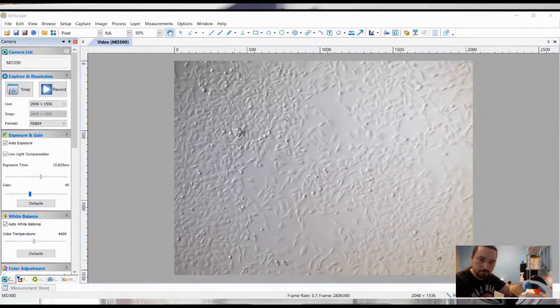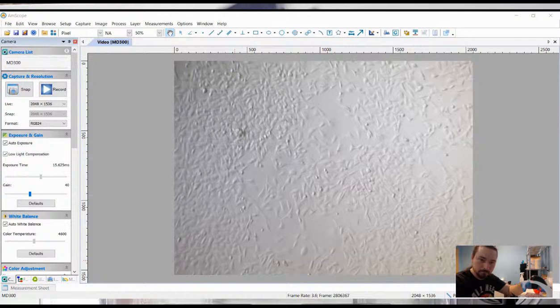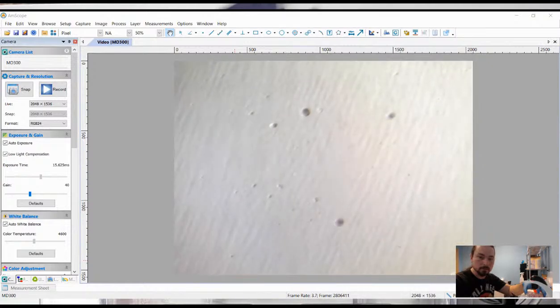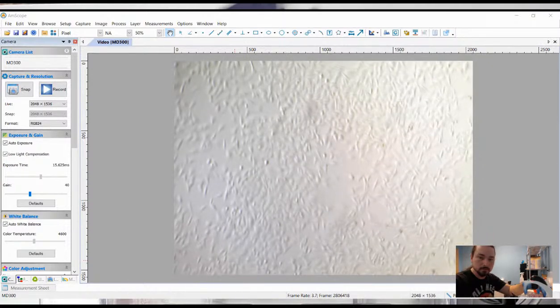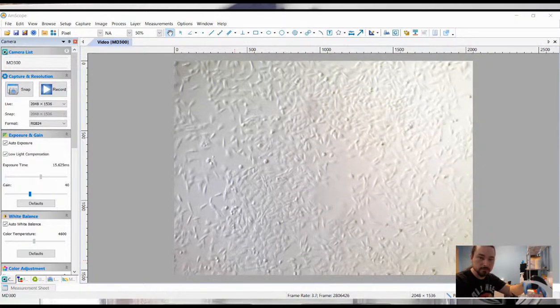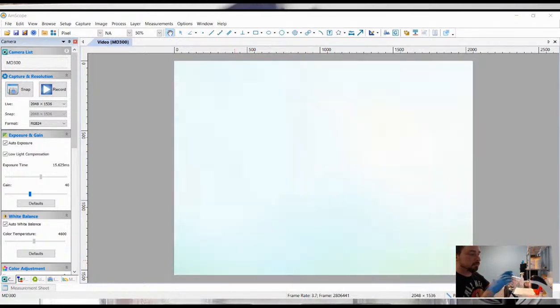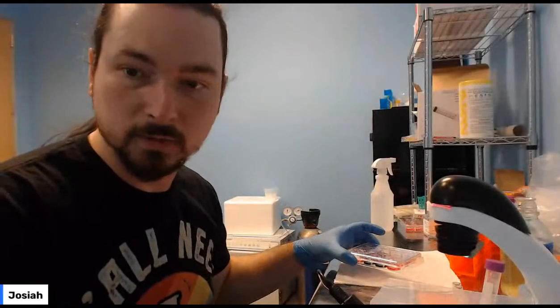And you can see it's about 70%. So this is about how you want them to look when it's ready. So once you go, here's another one. And so these are ready to go. These are ready for genetic modification. So, I've got 4. We've already got some that are done on this, and I'll show you in a minute. I want to show you all the final product as well.